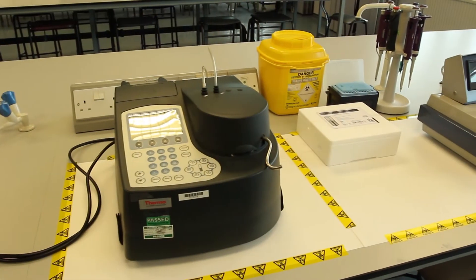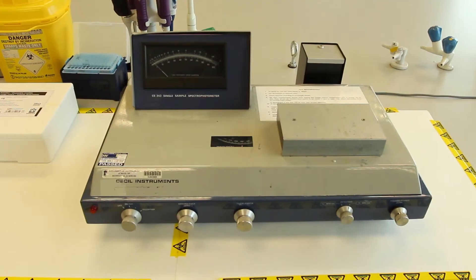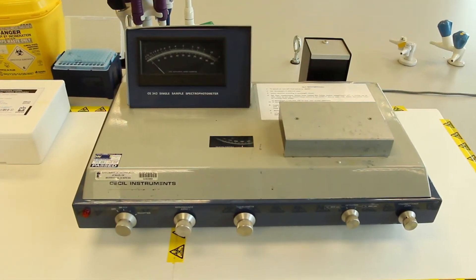In some undergraduate practicals you might be using older devices that have analogue displays, so learn to be flexible in your approach.